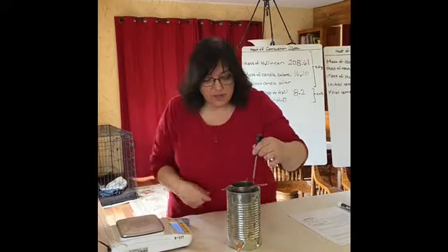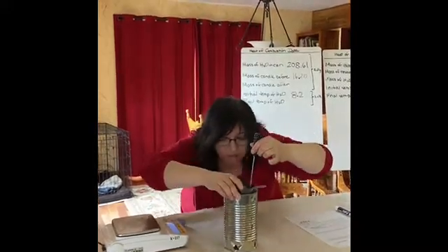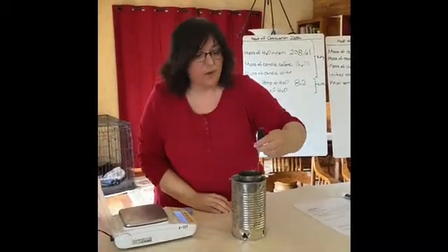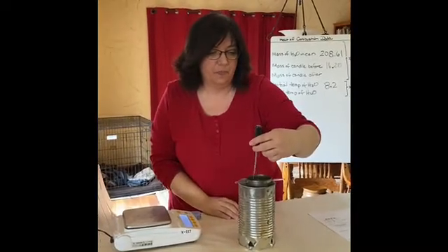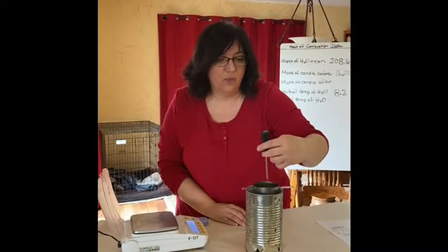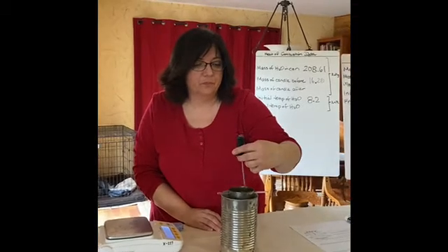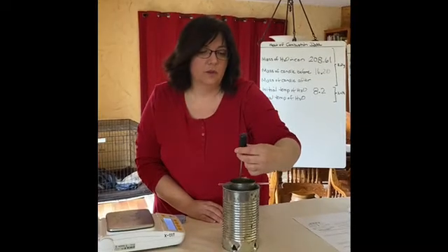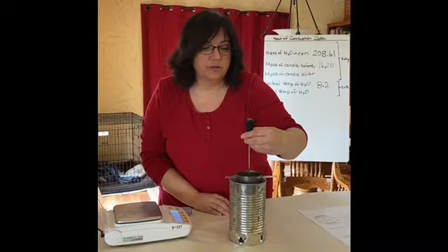We're going to blow the candle out and record the highest temp we get to. Okay, so I'm going to keep stirring the water till we get to a maximum temp. Right now I'm at 19.0. 19.1. Okay, I'm going to call it at 19.1 degrees Celsius.